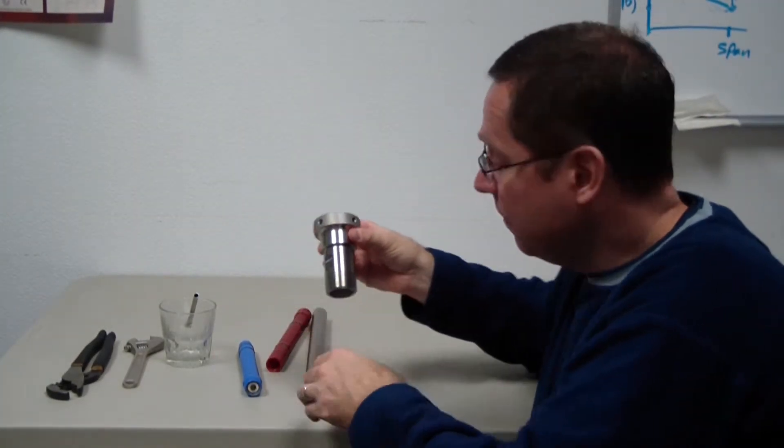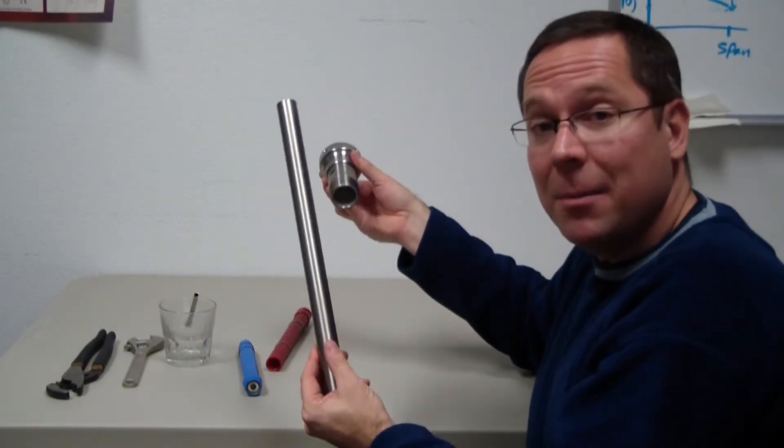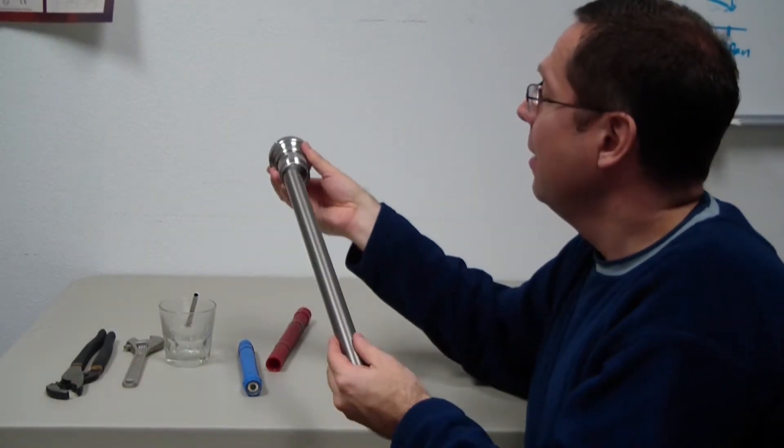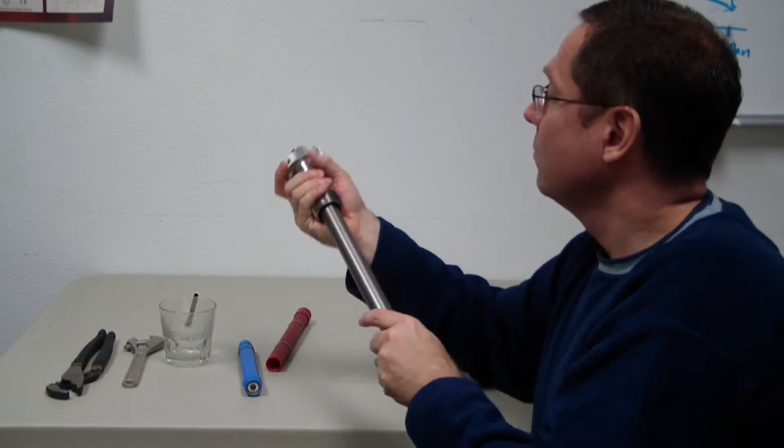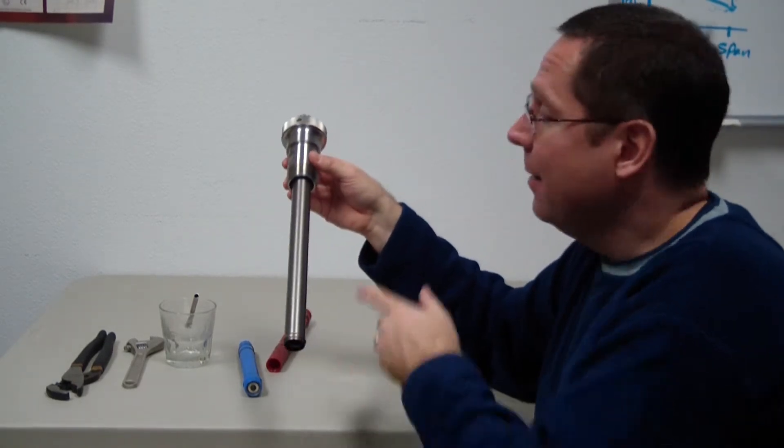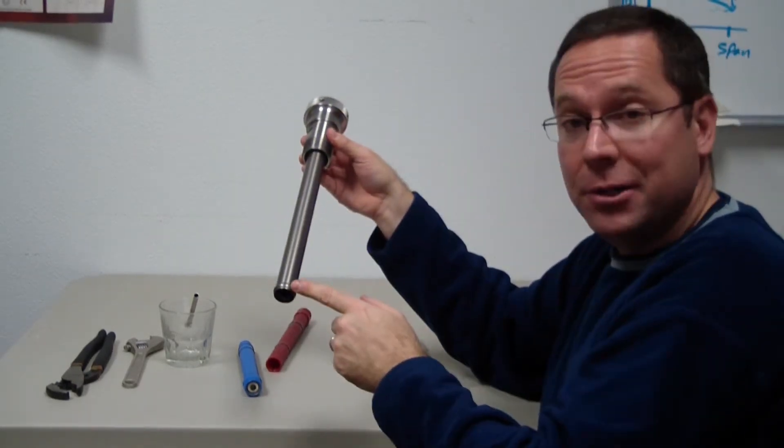So let's put one together. First off, I'll take my metallic sheath and put the compression fitting on. You put it on opposite from the flare tip.